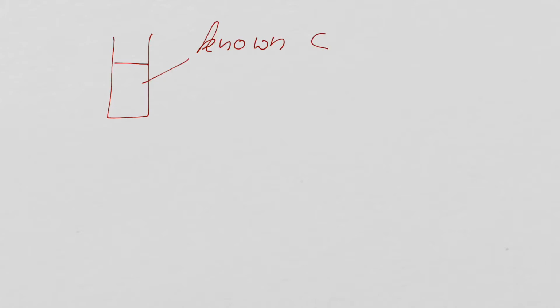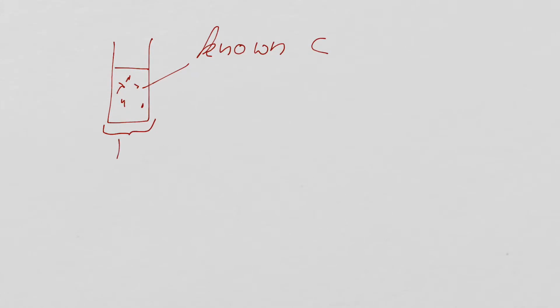Like that, known concentration, in a known path length, say 1 centimeter. We whack that into our spec.